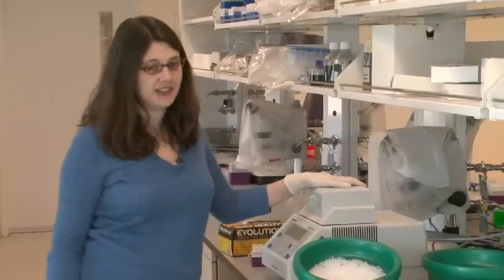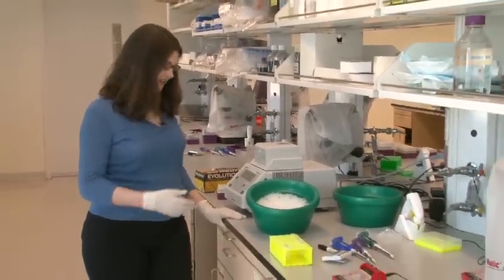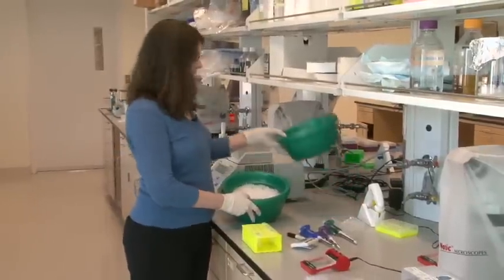Now, this process actually takes a few hours, and so I set up PCR reactions before we started filming, and I have them in this ice bucket here.